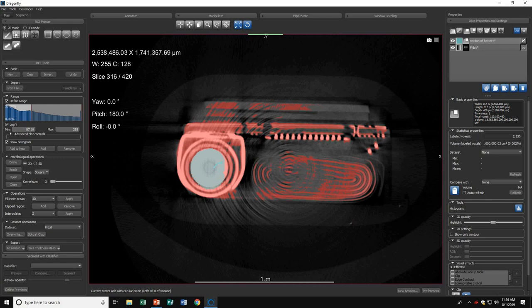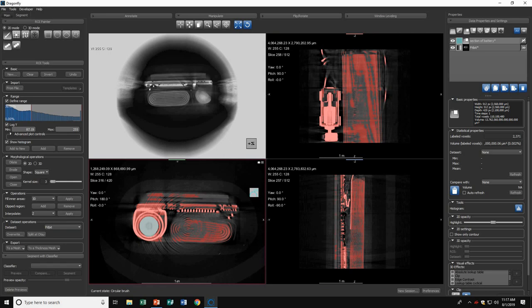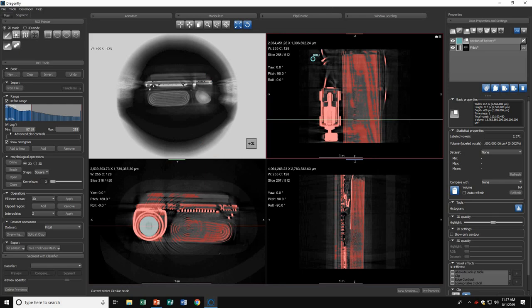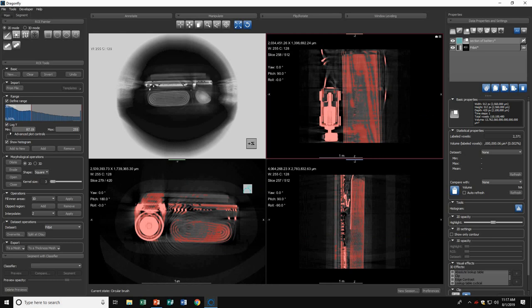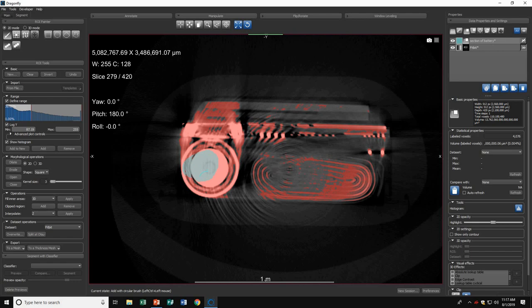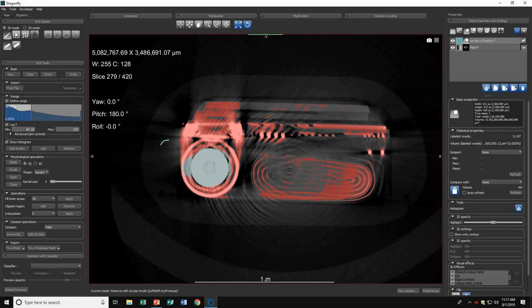Once I've painted this section, I'll move to another slice. You can see the slice I just highlighted. I'll move to another slice where I want to end my region. Again, use left control to highlight. If you make a mistake and highlight outside the region you want, you can use left shift and left click to remove the mistake.